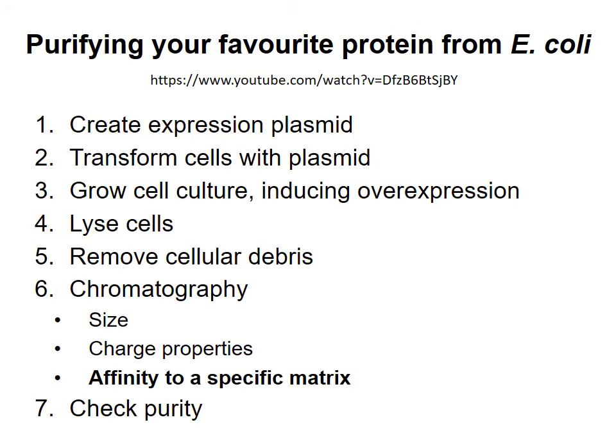The basic steps in the process are listed here. I've already talked about how to put your gene into a plasmid, and I'll talk more about the characteristics a protein expression plasmid should have shortly. You grow the cells containing the plasmid in a liquid culture and induce a high level of expression from the gene.